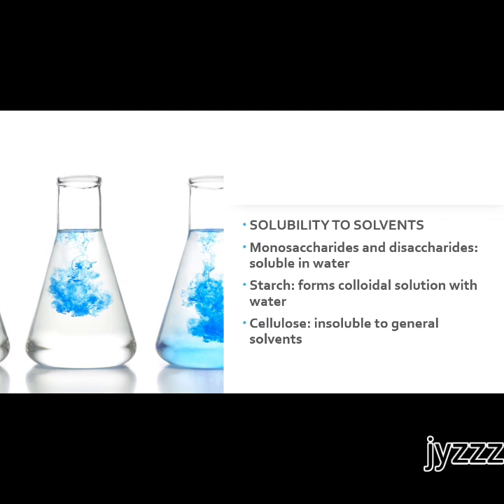Your cellulose here is insoluble in general solvents. It is insoluble in water, insoluble in ether and other general solvents, and also insoluble in alcohol. That is for the solubility of your carbohydrates.